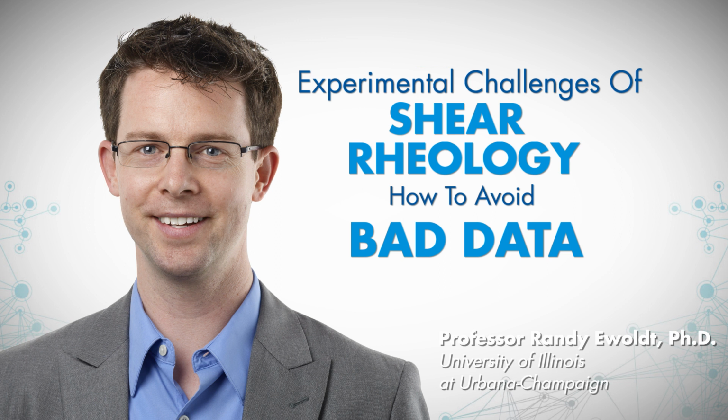Okay, those are some good guidelines. Now there's been a couple of questions on normal forces. You've talked about the impact that rotational inertia and inertia can have on torque measurements and therefore G prime and G double prime. Can you comment on any contribution that inertia would have if you're looking to measure normal forces?